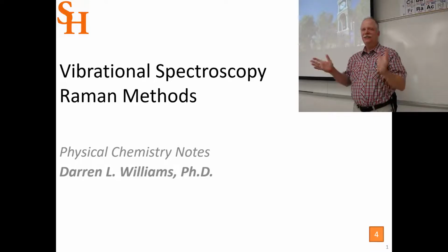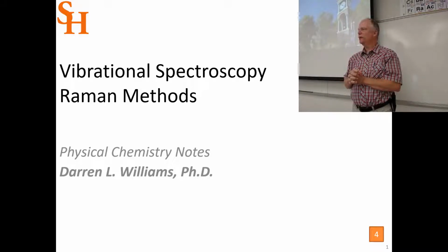And so this week in the lab, we're going to do vibrational spectroscopy. So you're going to be doing Raman and IR. And so you'll get to see the Raman instrument that we have upstairs. You can do the sample analysis and so on if you want. You can sit and watch. You can also look at the Raman Spectrometer. We have a 532 nanometer laser.